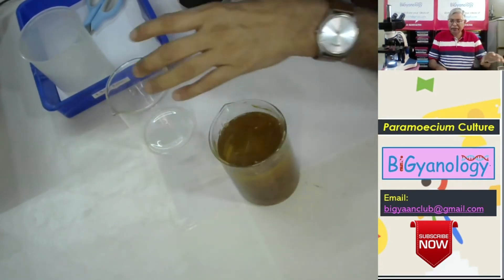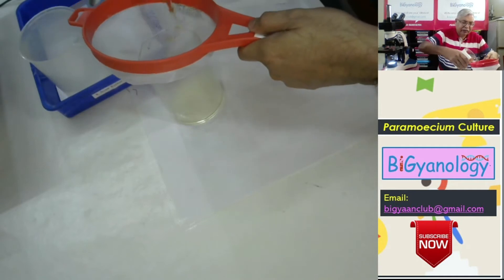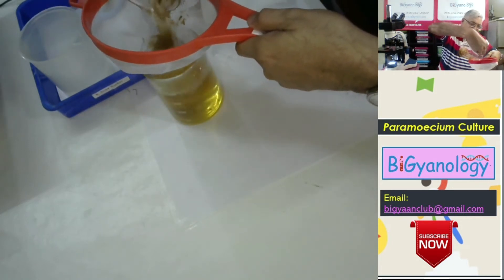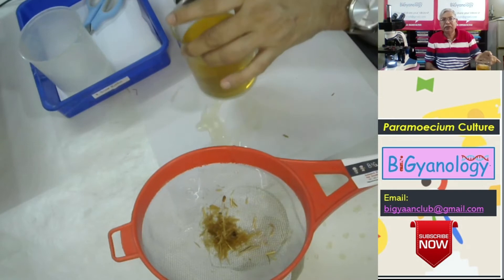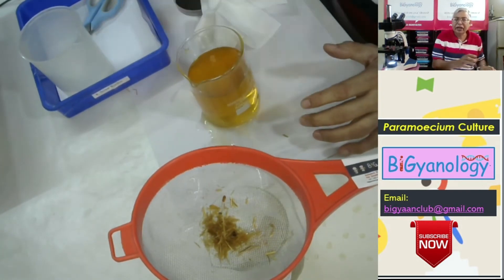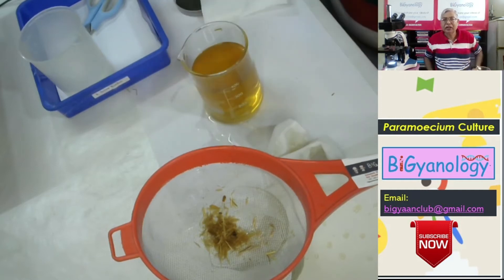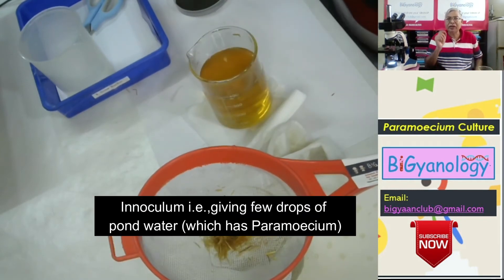After this, we will save the hay. It is very very hot now. Now we got this hay water. This hay water with rice — rice infusion — is ideal for this culture. We call it paramecium hay culture. This has to cool down for about a day. After that we will give a small inoculation of paramecium from a pond or any local water body, which we call inoculum.